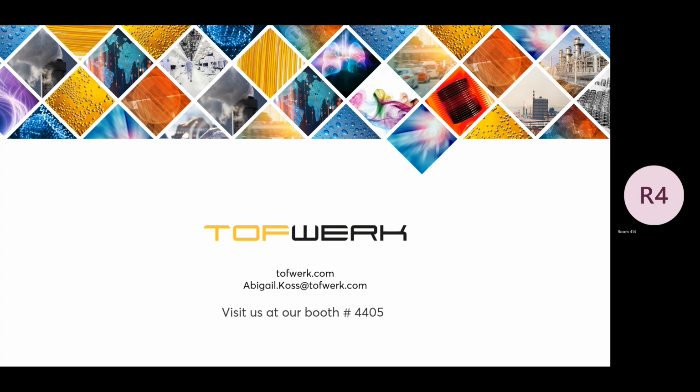Questions? Question about your TCE history. Did you ever give us the source on that? That's a good question. If we look in the NEI, there is one emitter registered at that location, which is a woodworking shop. I don't think that's what they actually do as a business, having driven by there many times. And what they report as their emissions does not match at all with what we measured.